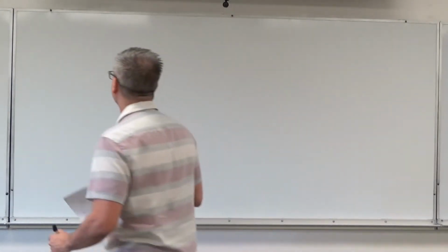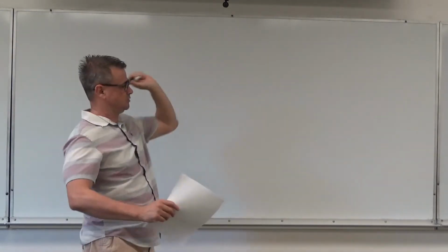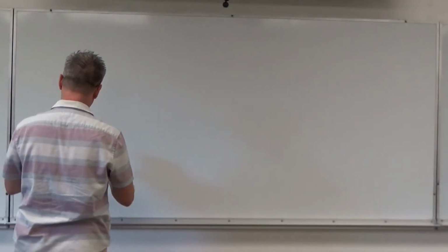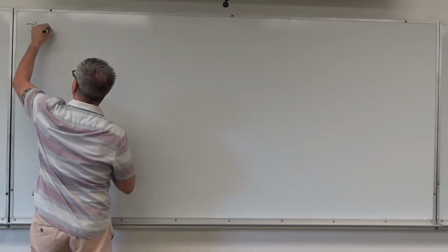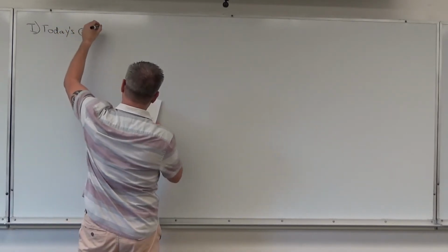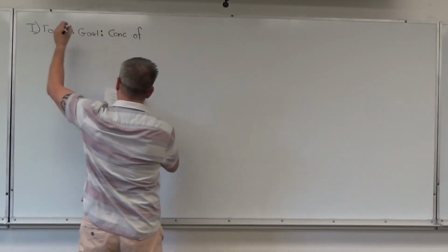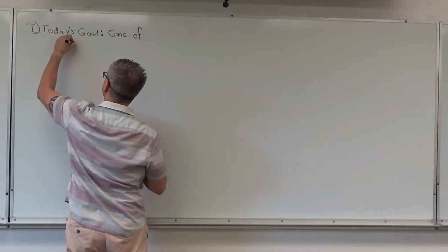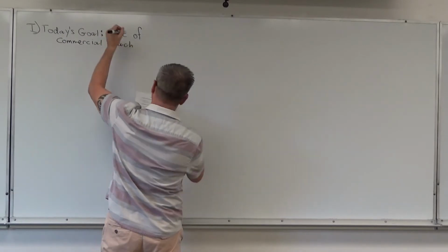So anyway, all right, what we're doing today is getting a new pen. Okay, so today's goal: we are looking for the concentration of commercial bleach.